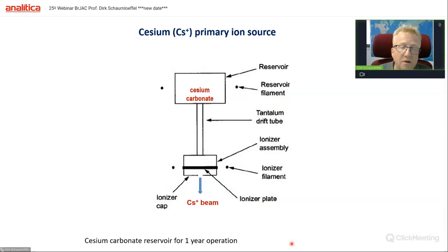Such a cesium ion source, this cesium carbonate reservoir, lasts for more or less 1 year of operation, and then it has to be replaced, because then the cesium carbonate is everything is used.